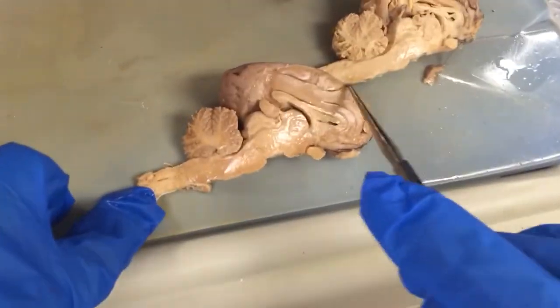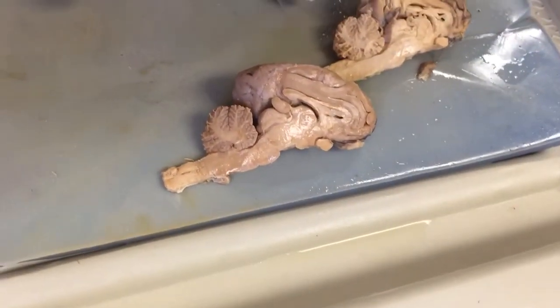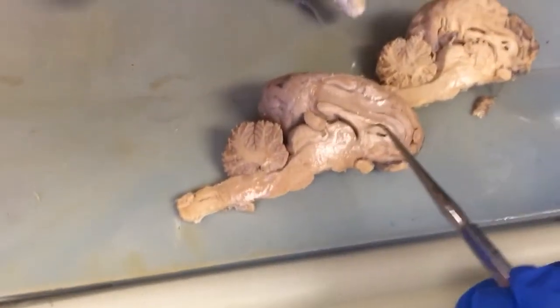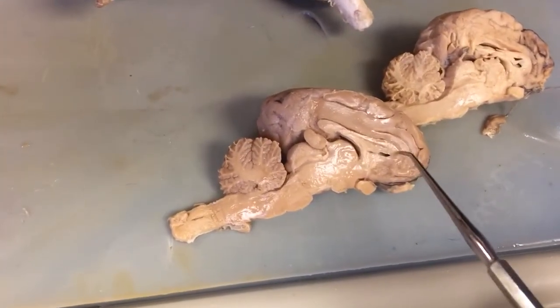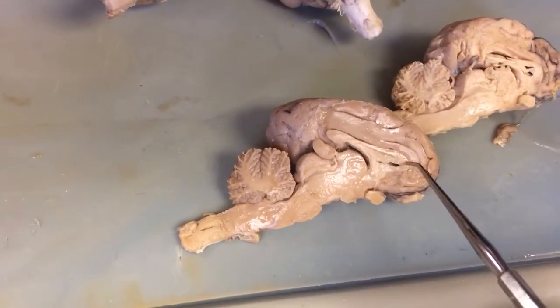Okay, so for this one, because there are so many detailed names, I'll start from one area and go over it. So for this corpus callosum, the front corner of it here is the genu, right? That's on the lower figure here.